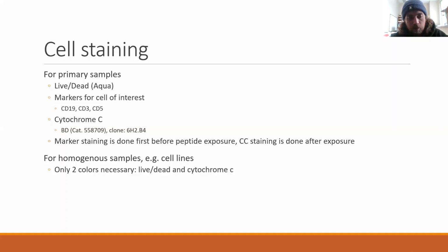The cytochrome C antibody we use for the staining is listed here. I put the catalog and clone down. I've been using this antibody for a while now, and it stains very nicely. So I would recommend this antibody if you're going to try staining cytochrome C.